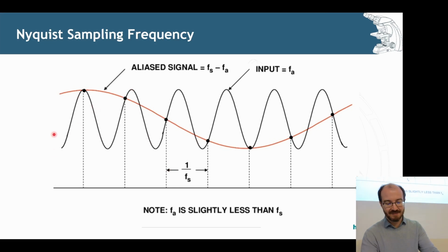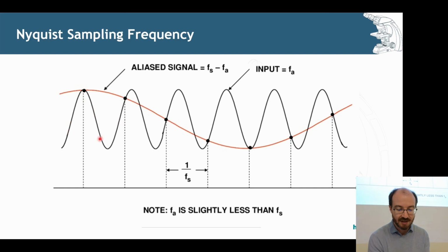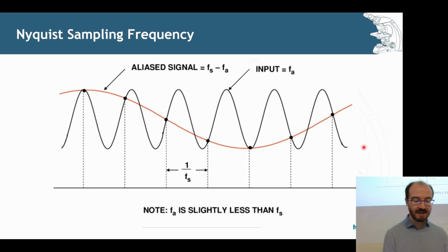more than the frequency of my dips, because if my sampling, that's the word I'm looking for, my sampling is too low, then you see that I'll capture something that looks like this, and now it seems like there's my peak and there's my dip, and this is actually how it's going to be rendered. It's going to show a dip there when there is in reality not one big peak and one big dip, but it's actually a lot of peaks and a lot of dips. So just undersampling or making the spatial resolution too low can lead to incorrect interpretations if you're not careful.